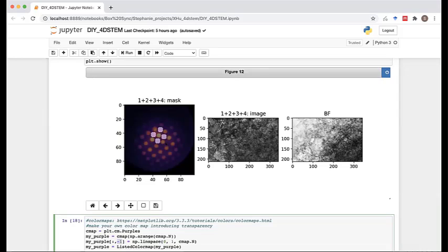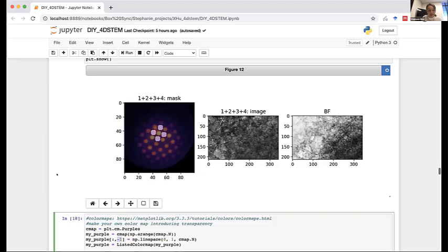Right? Yeah, totally. So all these packages can do very similar things to what we've done here. There are different challenges when it comes to writing your own code and the learning curve for that, versus understanding someone else's code and the learning curve for that. So it depends on what you want to do for your analysis.